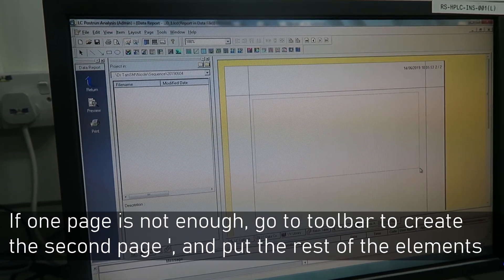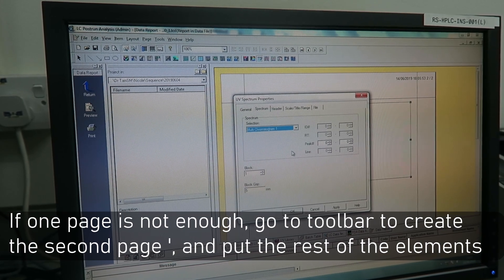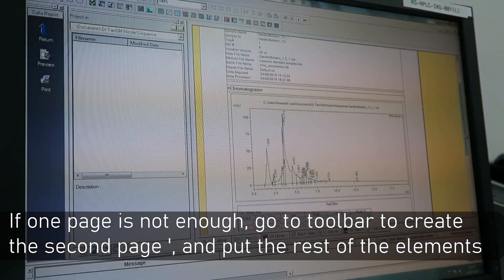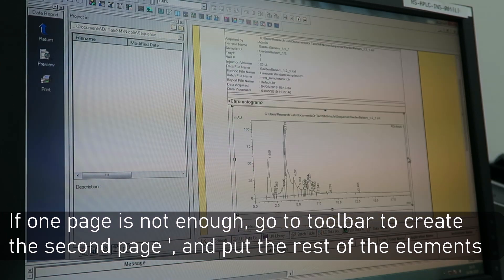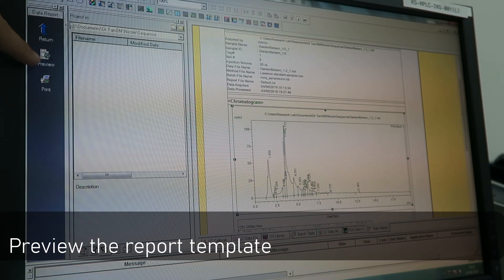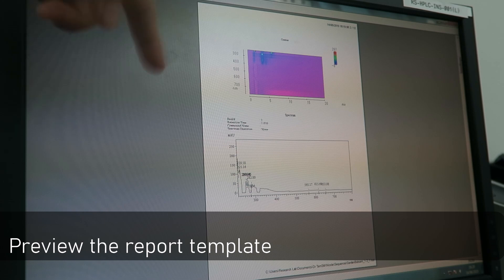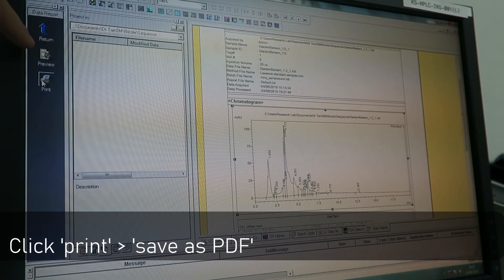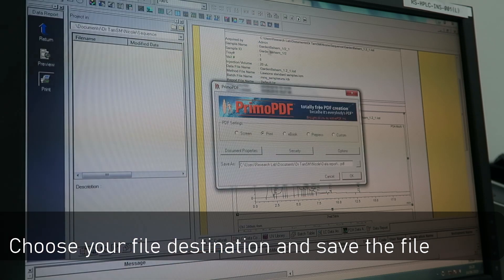If you do not have enough space on one page, go to the toolbar to create a second page and put the rest of the elements. Then go to preview to see whether everything is properly arranged and in the correct ratio. If everything is okay, click Print and Save as PDF. Choose your file destination and save the file.